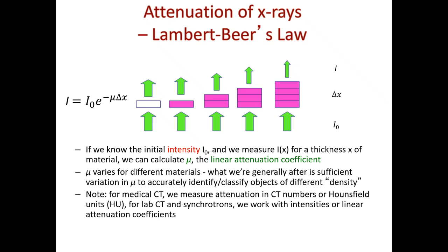That's what I kind of realized over the time. So technically, unless I have a very good reason to use all of these numbers up to 65,000, I simplify both memory requirements and my analysis. Okay. So anyway, we're going to do that once we start processing images. You can, for yourself, figure out, well, does it matter for my application? For some other application, it might actually matter, but for certain applications, it might not.